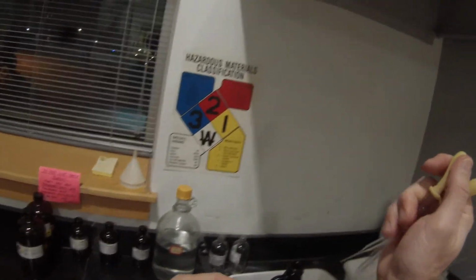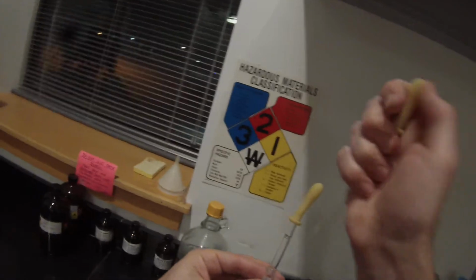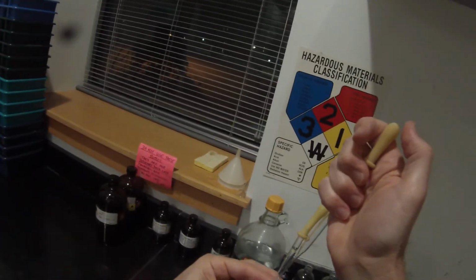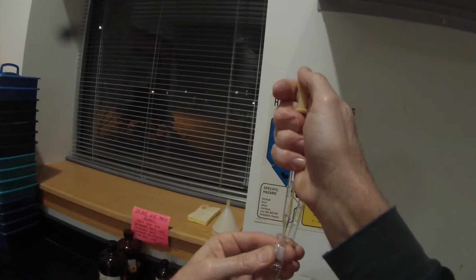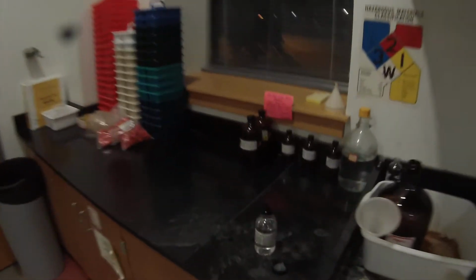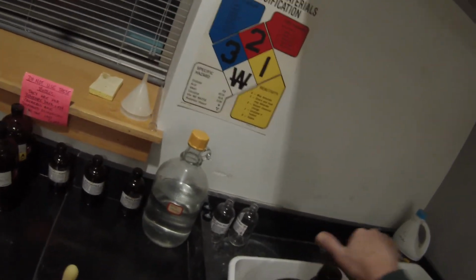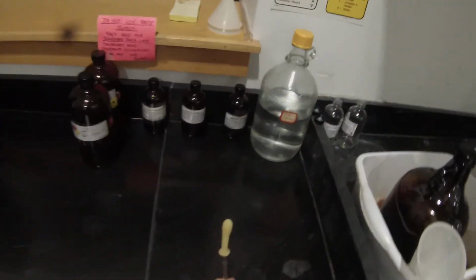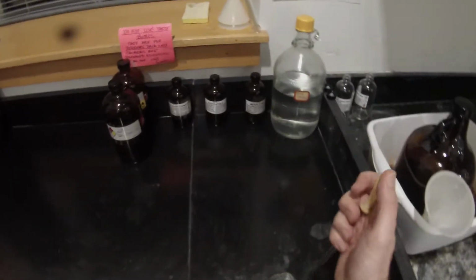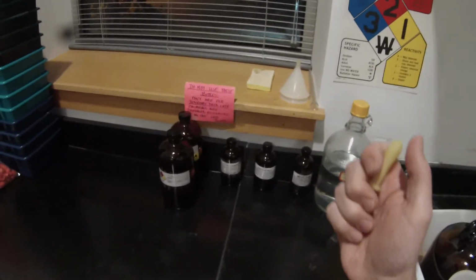And we will simply remove the majority of that sample to the waste, leaving just a couple of drops in the bottom. So that's maybe 1/4 of a milliliter or so. Then we'll refill that vial with fresh dichloromethane.